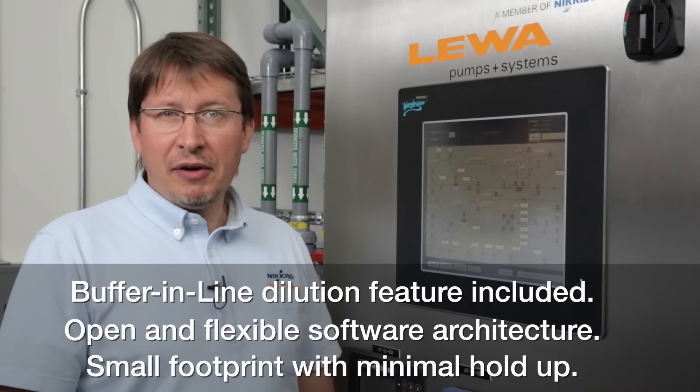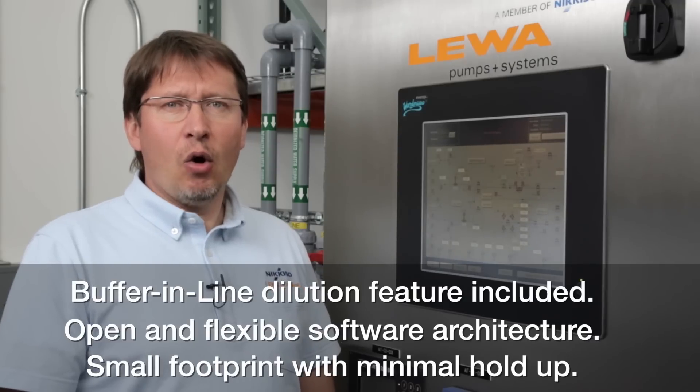Also, it can be used as a buffer in-line dilution system and it has a very open software architecture to allow wide control.